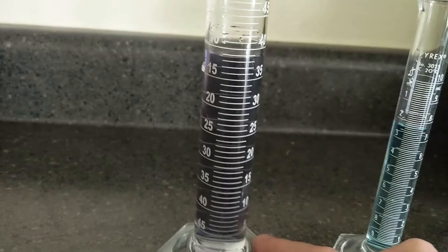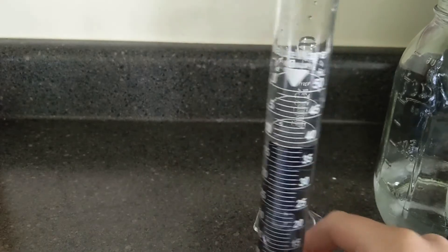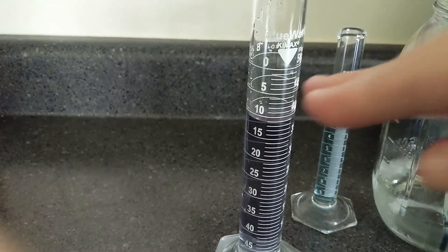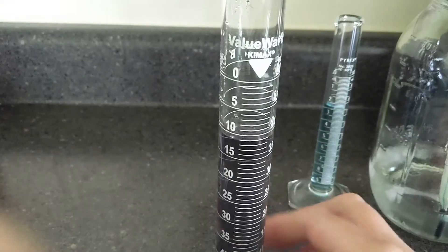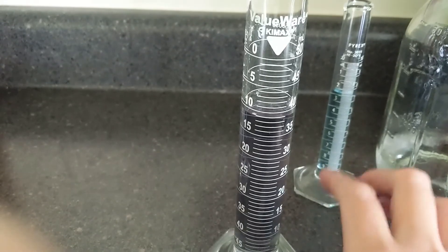We are going to read these graduated cylinders first. I have two graduated cylinders — I've put some food coloring in here so it's a little easier to read. We have one with purple and this one with blue. This is a 50 milliliter graduated cylinder. When reading graduated cylinders, we want them to be level on the counter, read at a flat level, and not pick them up because we will wiggle the water level. It's important to find a place with good lighting and a solid background — this black countertop is pretty good.